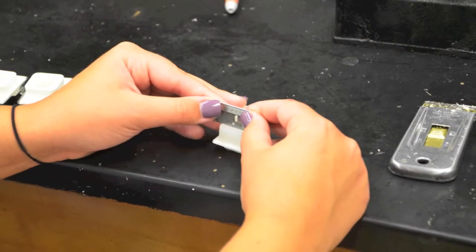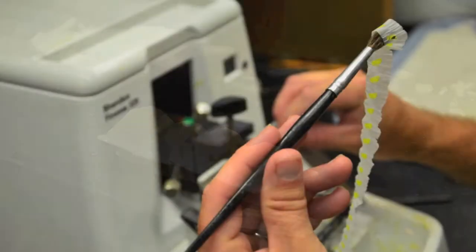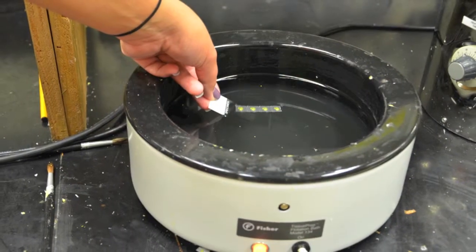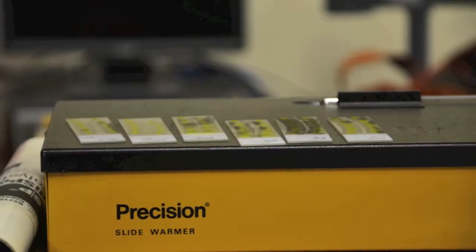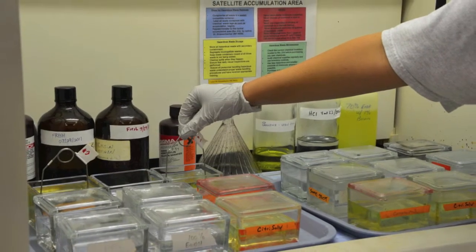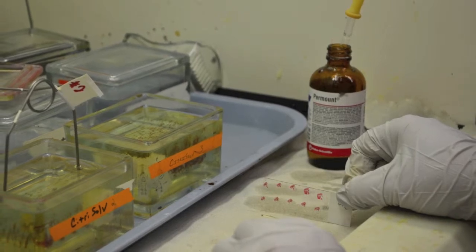The paraffin block containing the tissue was trimmed around the edges using a razor blade. We then mounted the block onto a microtome and sectioned the tissue at 12 micrometers per section. After sectioning, the ribbons were floated on a warm water bath and mounted on slides. The slides were then stained using hematoxylin and eosin, a cover slip was added, and the slides were left to dry overnight for analysis.